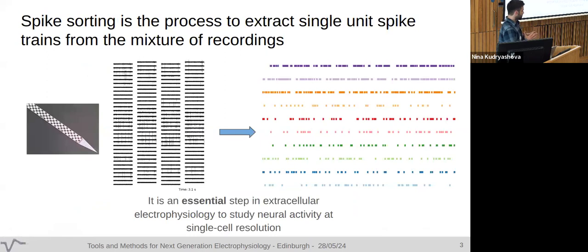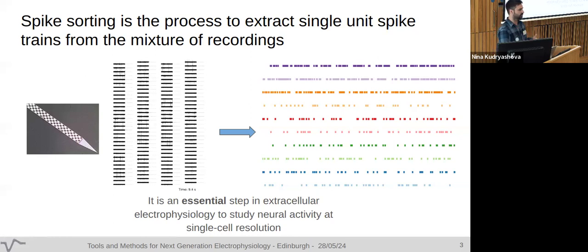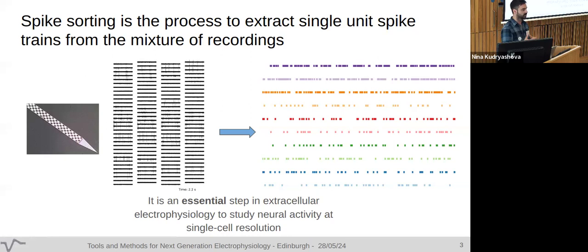But all of these recordings need to go through the same very essential processing step, which is: how do I get spike times out of my recordings? And these are essential for many applications. I would argue that in most applications for systems neuroscience, say you're looking at place cells or visual receptive fields, whenever you need a receptive field, you need very accurate spike sorting. There are some spike-sorting-less applications like looking at manifolds or brain-machine interfaces, but this doesn't mean that we can forget about spike sorting. Spike sorting will always be an essential step in systems neuroscience. Hopefully, otherwise we're all out of our jobs, right?